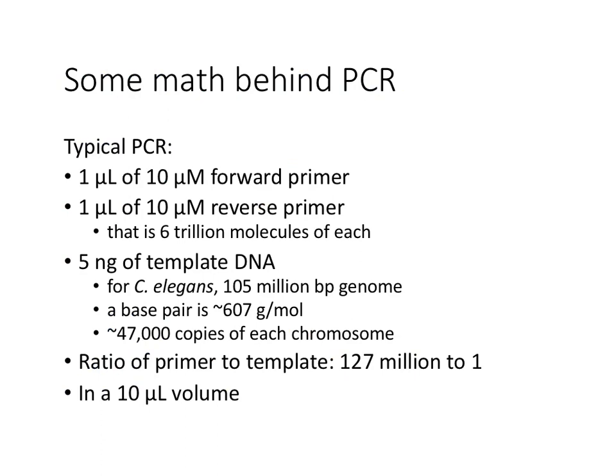You don't need to know this until you get to Biology 104 or until you start working in somebody's research lab, but just to give you an idea of how this actually works in the laboratory, we usually set up 10 microliter PCR reactions, with a microliter being a millionth of a liter. So, a tiny little drop of liquid, 10 microliters, that contains what's written up here.